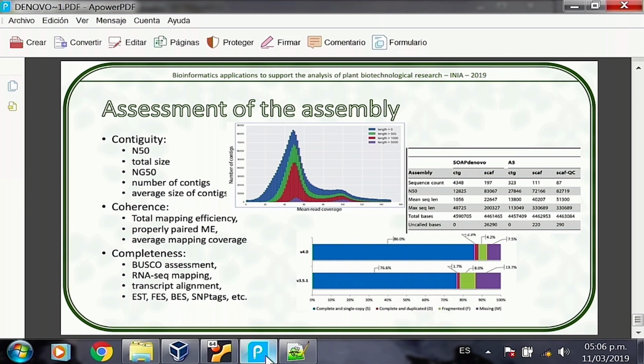From the reference genome, we know that some parts are coding regions, like genes, and some parts are not. We can mostly measure the parts that are gene-rich, right? So we say, okay, what are the genes that appear more commonly between all the species of this particular clade? That is a BUSCO dataset. A BUSCO dataset has been compiled in such a way that it selects the most common, the most universal set of genes in a specific clade.